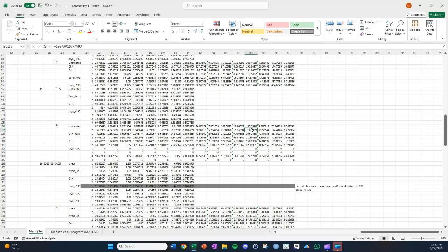You do still see a decent amount of variability. So this is the untreated control. For example, replicate 1, replicate 2. In the first replicate, the contraction and relaxation speed went down. In the second replicate, the contraction and relaxation speed went up. So we do see that variability. And I think probably there are some things you could do to minimize it.